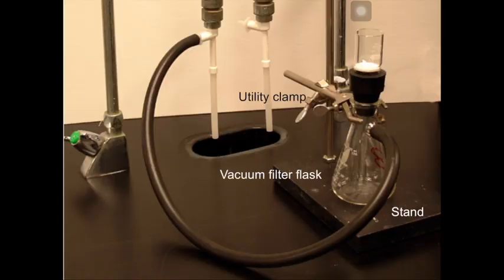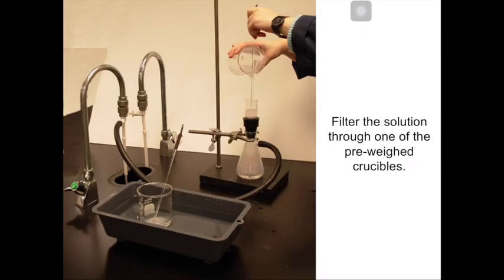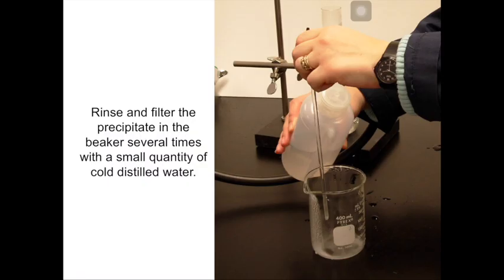So this setup is a filtration setup, particularly a vacuum filtration. You have your crucible mounted on top of your suction cone, using the aid of a utility clamp to hold this setup all together, and your vacuum filter flask is placed here, connected to a vacuum pump using rubber tubing. This rubber tubing will cause a pressure difference in order to aid your filtration. What happened here is the solution is filtered using a vacuum filtration unit. The beaker has been rinsed and placed once again on top of your filtration unit.